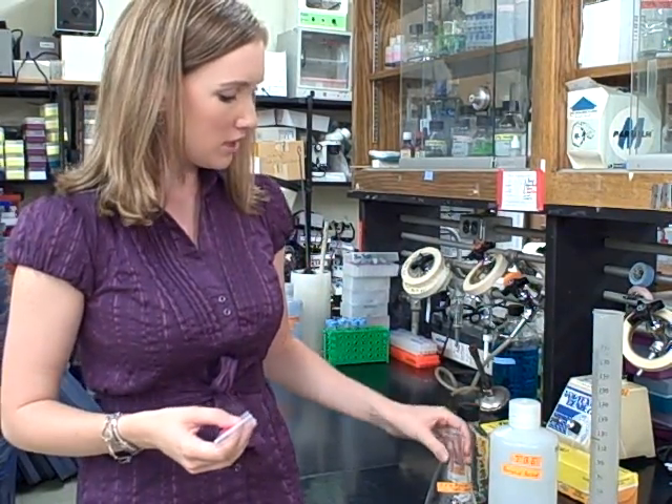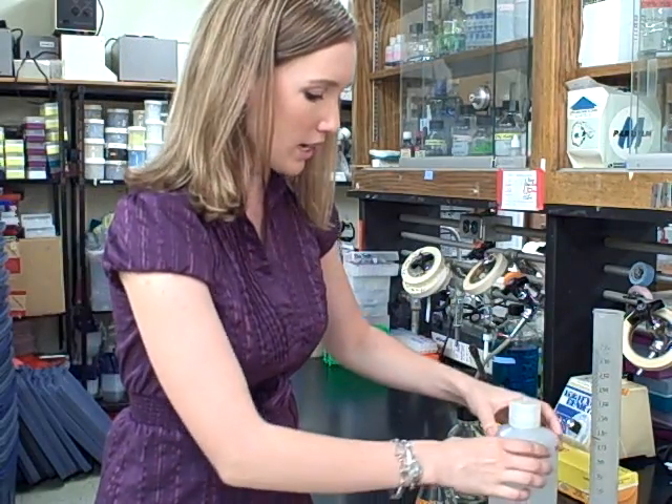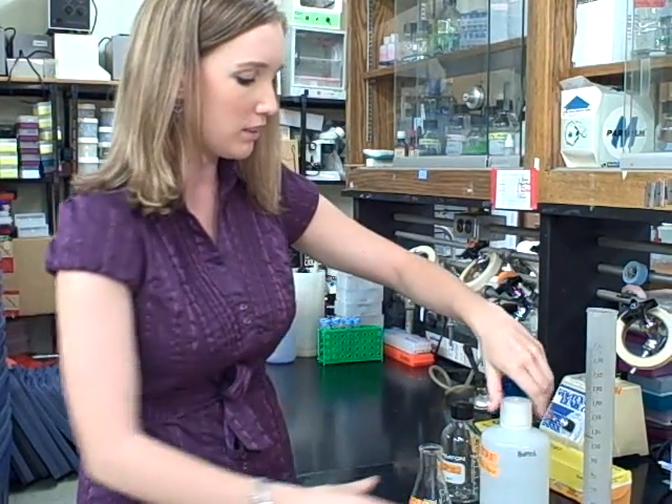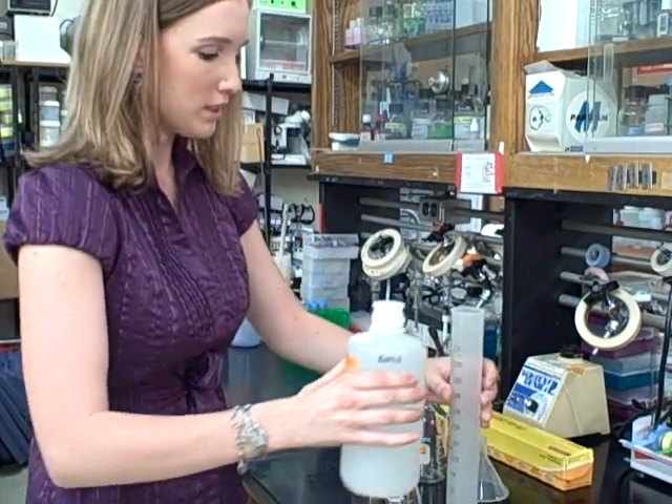In this case we're going to make 125 milliliters, so we're using a 250 milliliter flask. I'm going to measure out 125 milliliters of TBE solution into a graduated cylinder.